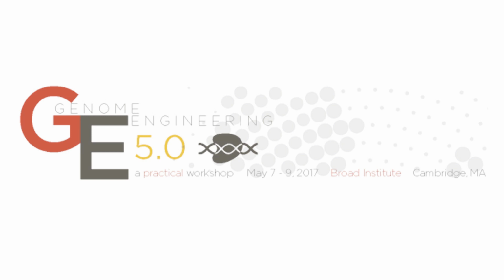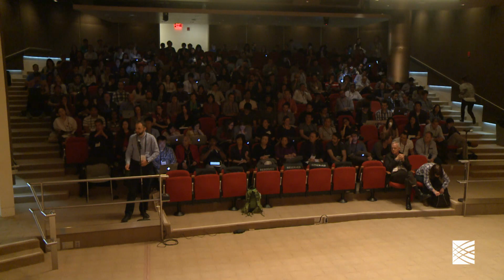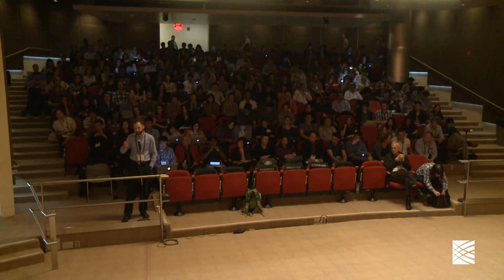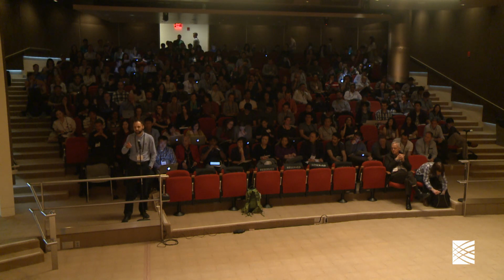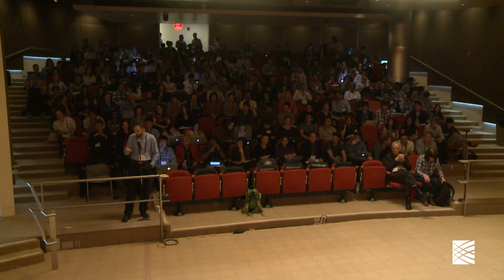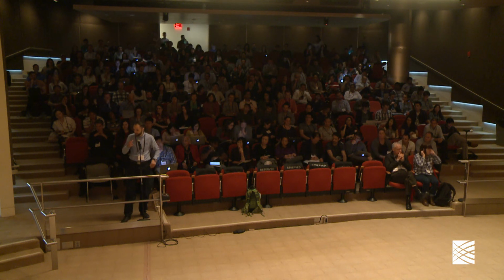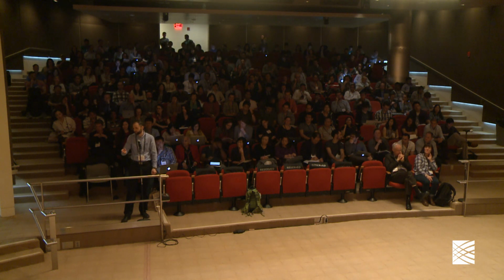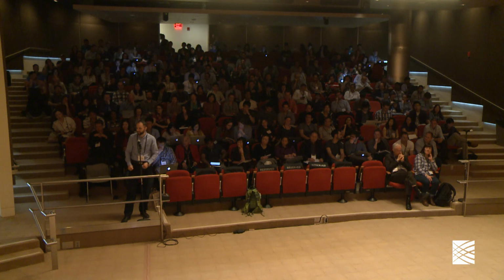Thanks for the talk. It was very informative. You were showing the ways to screen for the indels happening, or for the editing happening, and you were showing the Surveyor or the next generation sequencing. There is one method that is called TIDE. Have you heard about that? Did you check how efficiently it's detecting compared to Surveyor or the next generation sequencing?